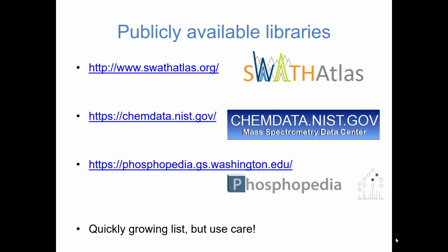I would argue that they're not similar. They're similar enough for being able to pick a handful of transitions and hope that some of them work, but they are not good enough for doing scoring. For example, the intensity of the fragment ions shifts dramatically. So from a correlation coefficient perspective, it's not very effective. It is sometimes helpful for being able to pick the most abundant ions, but just as we were talking earlier, that doesn't necessarily help you for scoring where that peptide is. I think you definitely wouldn't be able to use it for phosphopeptides.